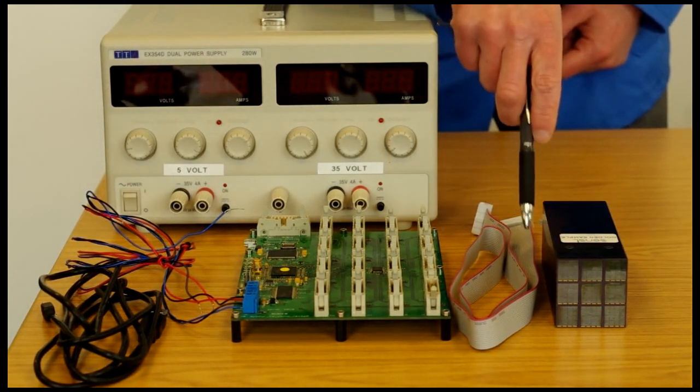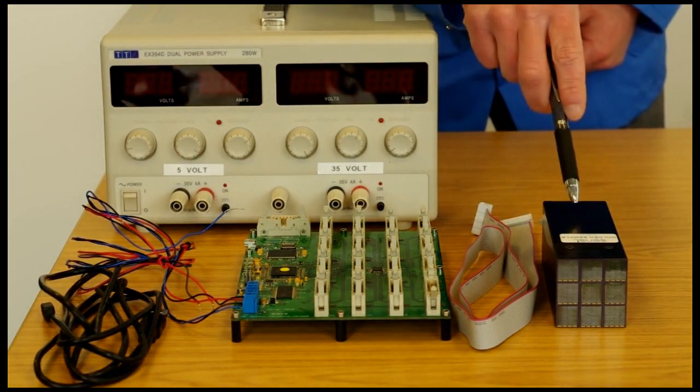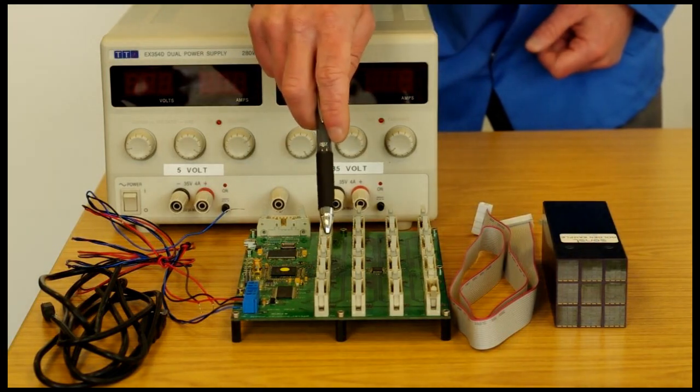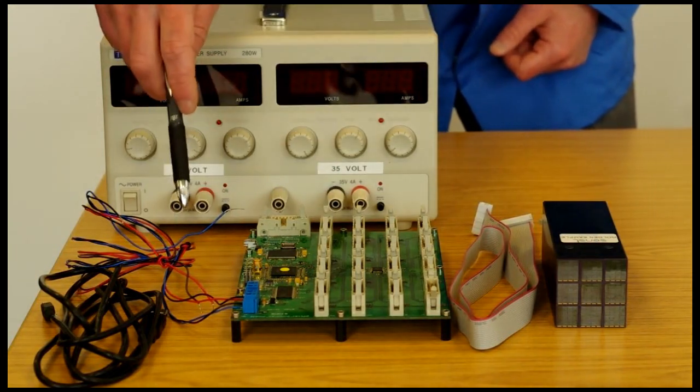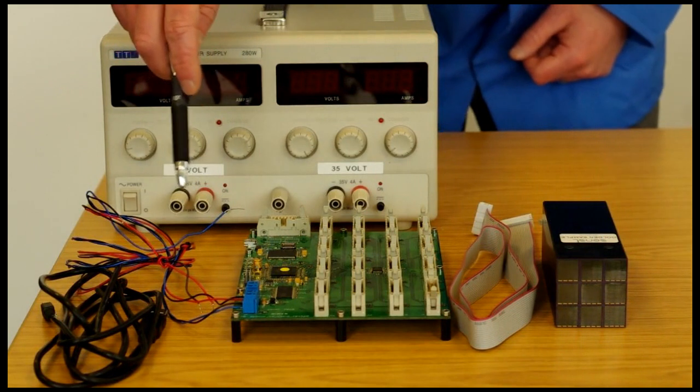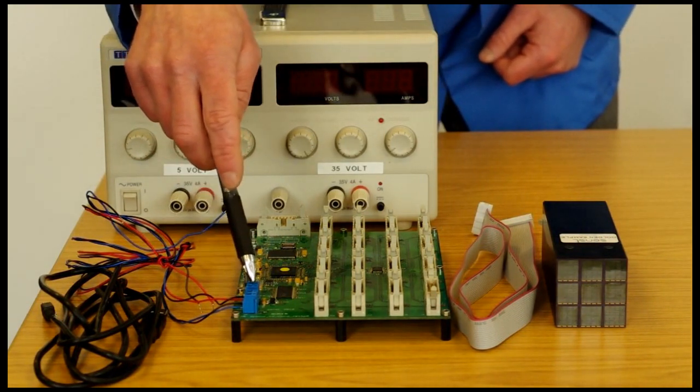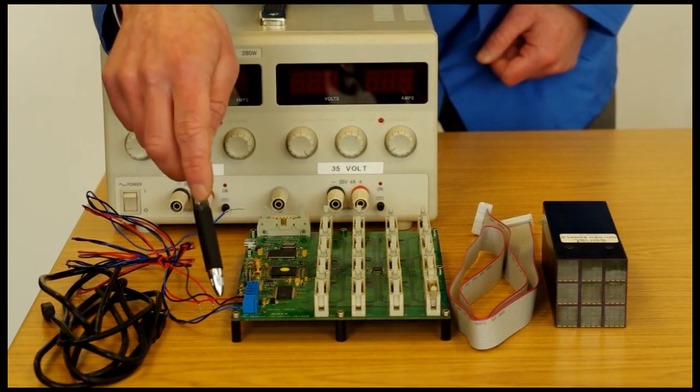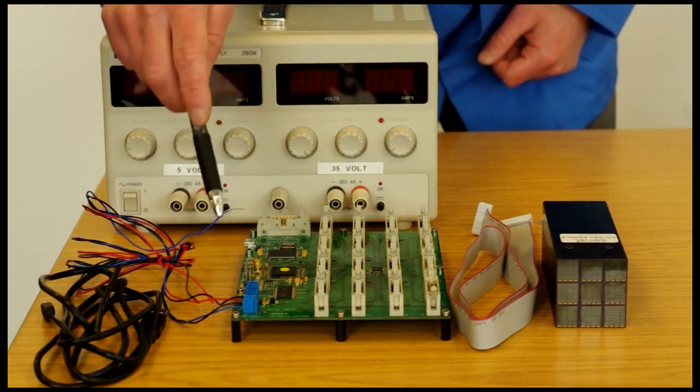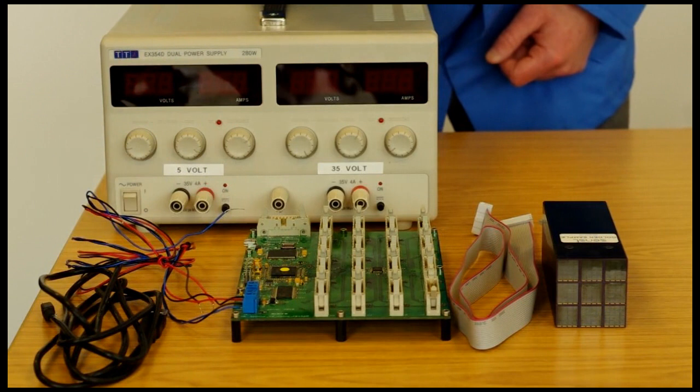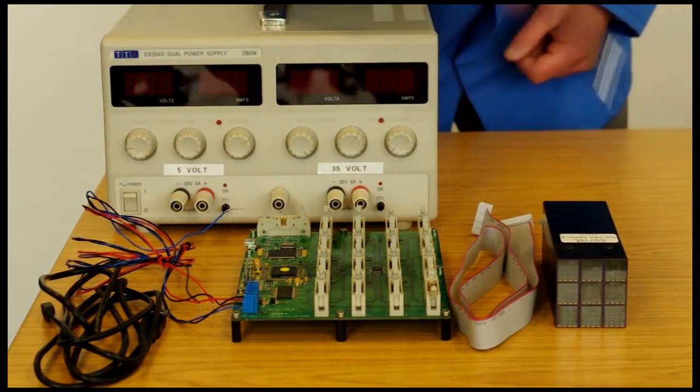The IDC cable connects our Matrix SL9 to our Matrix EVB. And the power connections are shown here where the plus 5 volts that goes to the Matrix EVB is the red cable and the blue cable connects plus 35 volts and supplies the power to the detectors.